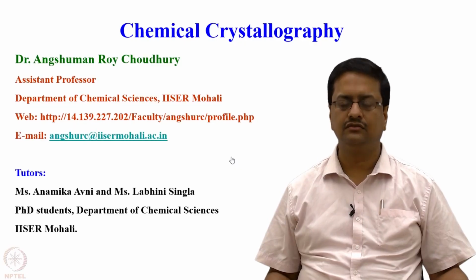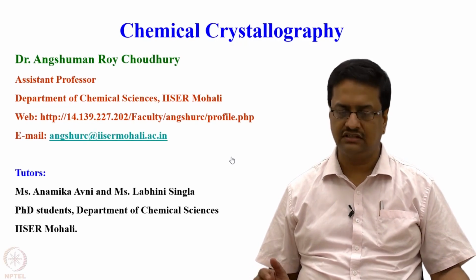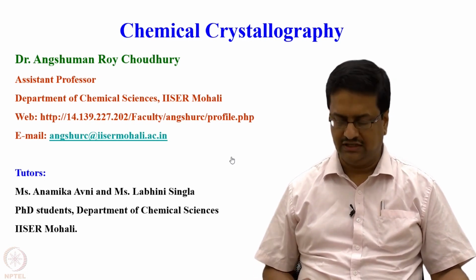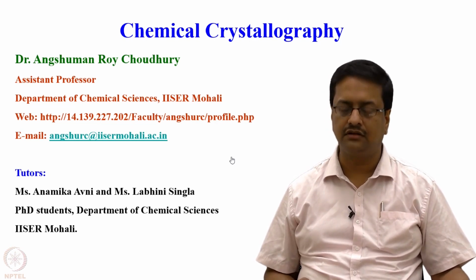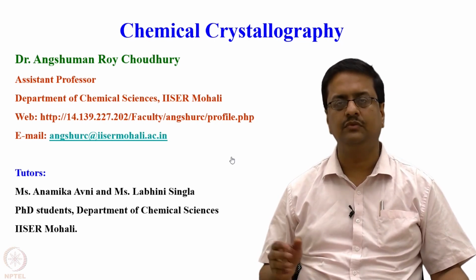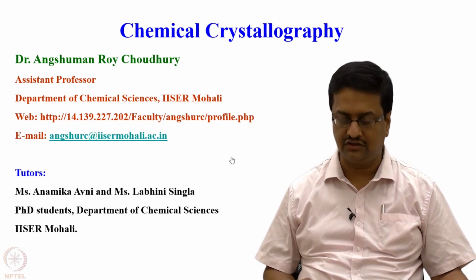Welcome back to the course of chemical crystallography. Today we would like to discuss the basics and applications of powder X-ray diffraction using a presentation, and then in a later stage we will take you to the powder X-ray diffractometer room and show how the sample is prepared and how the diffractometer is used and the data is recorded.